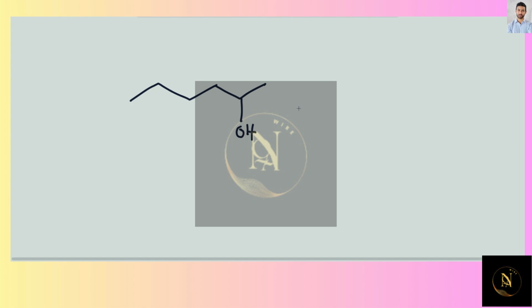And what we've got to do is decide what is the structure of this base peak in our spectrum. Now, the base peak is just the tallest peak. That's all that base peak means. It's not the molecular ion, it is the tallest peak. And when I look at the plot, I see that the tallest peak occurs at 45 m over z.